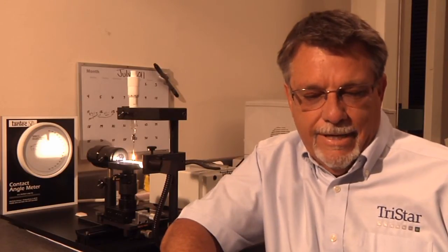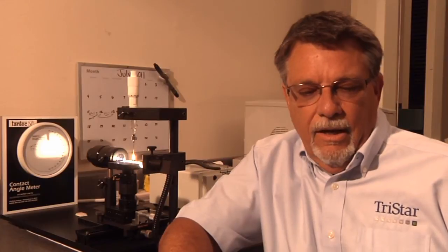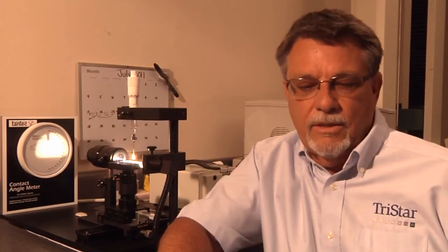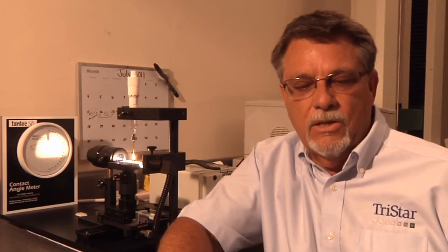Today's question is from Alex in Springfield, Massachusetts, where he asks: I understand that plasma treatments can be used to change the surface properties of a plastic, but how do you measure that in a tangible way?